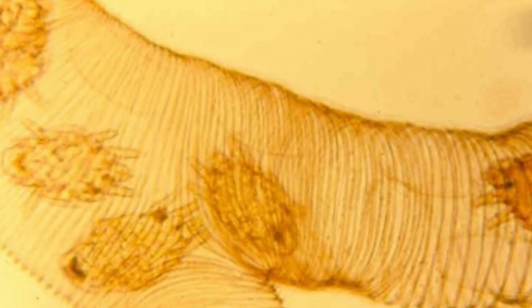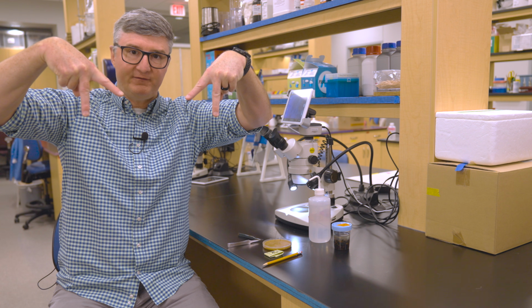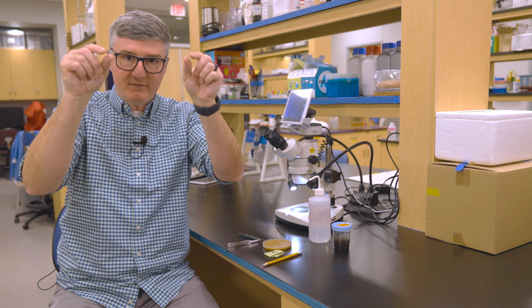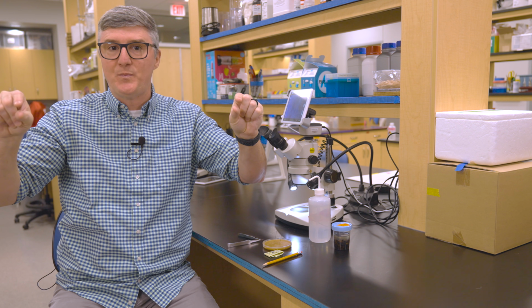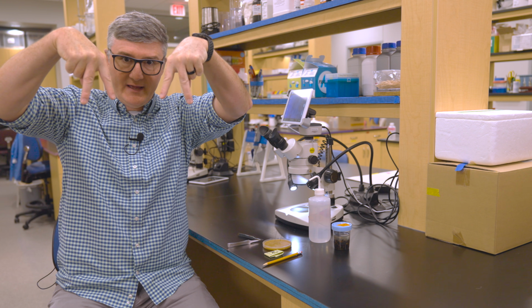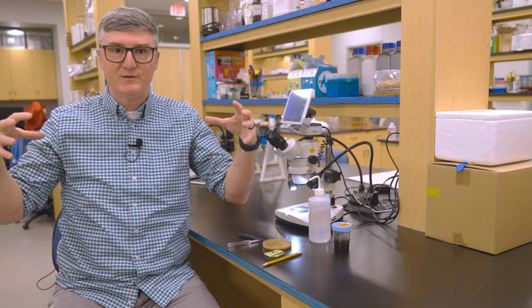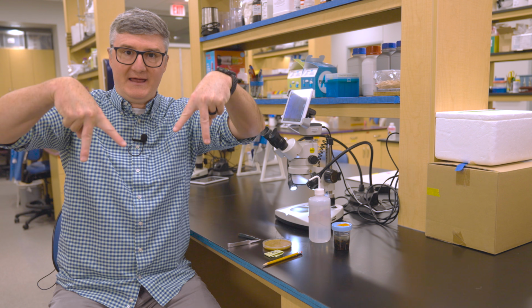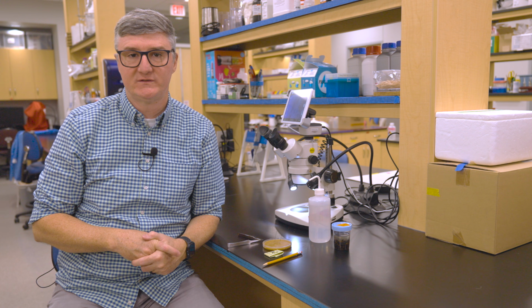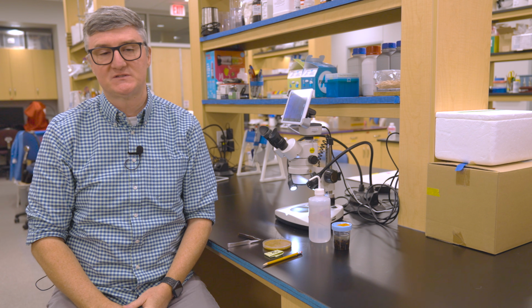And when you dissect a thorax, the tracheal system in it will look like upside down letter V's, with one leg of the V going to the side of the thorax, opening to the spiracle, with the other leg of the V going into the center part of the bee's thorax. So we are going to be dissecting that bee to try to get to that V-shaped tracheal system in the thorax. So now I'm going to walk you through the series of steps to do this.